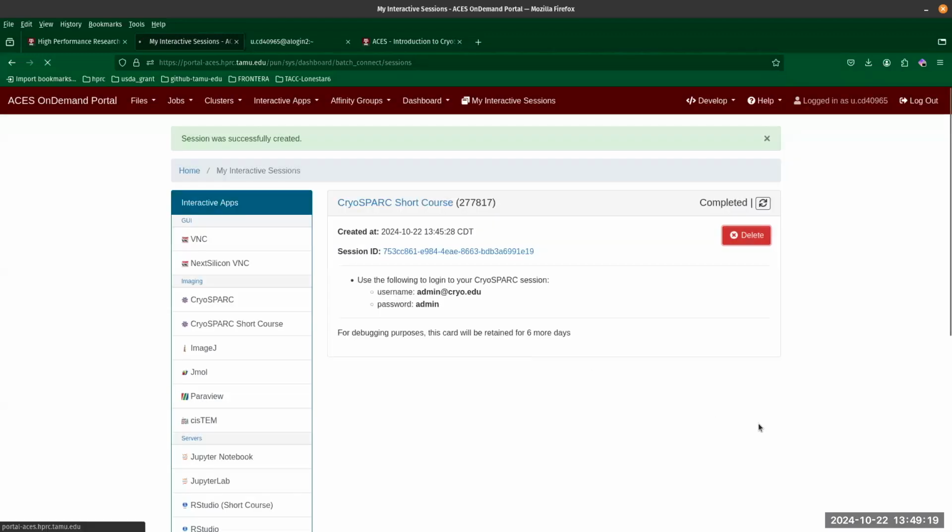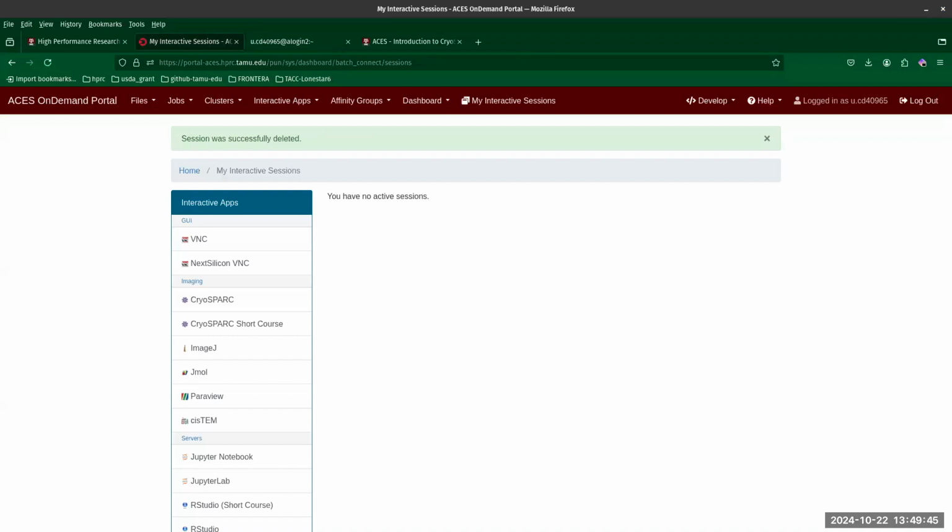I'm going to start another session. Did anyone have success getting their CryoSPARC session? Okay, everyone else got their CryoSPARC session started? I'm going to try that again.